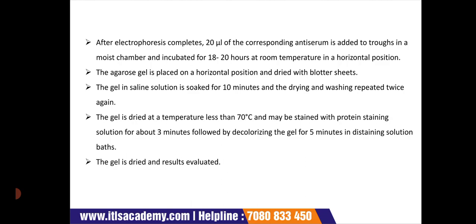That is followed by decolorizing the gel for 5 minutes in the destaining solution bath. The gel is dried and the results are evaluated. So this is the procedure. Here you have to keep two or three things in mind: the temperature at which the gel is dried, that is 70 degrees centigrade, and for how many minutes you have to decolorize the gel, that is 5 minutes.